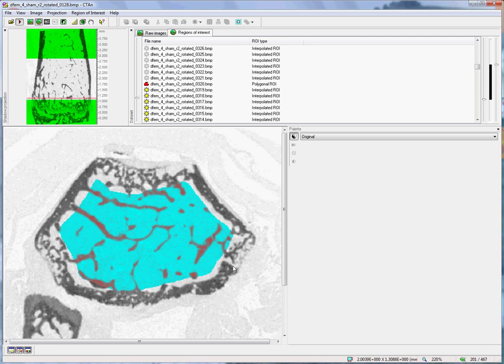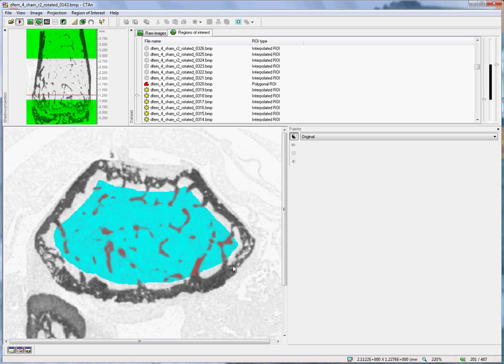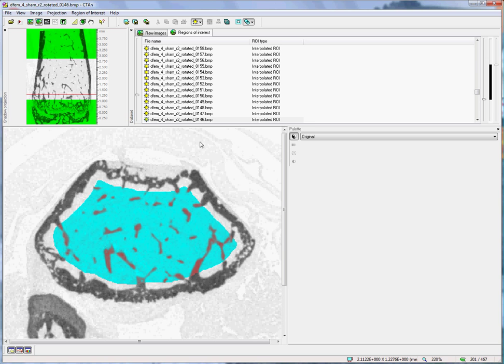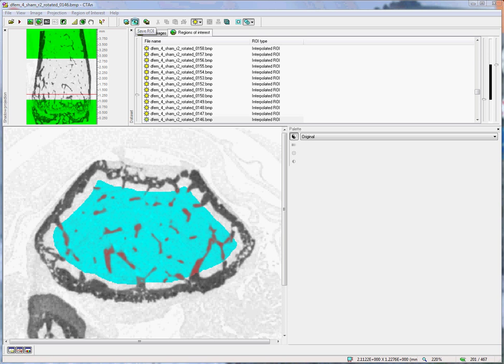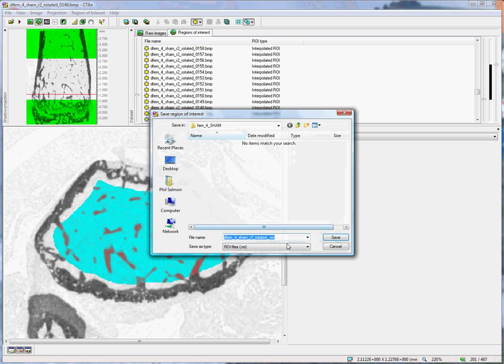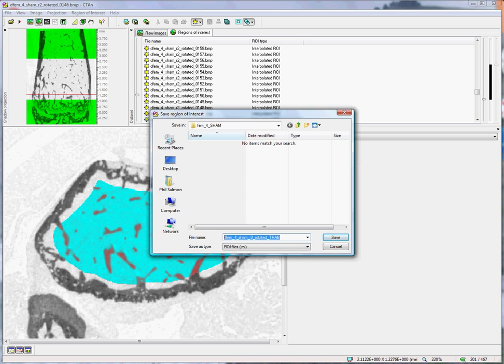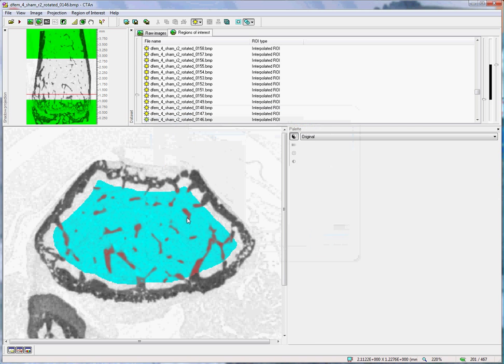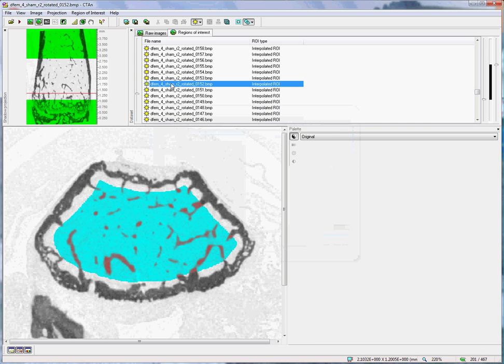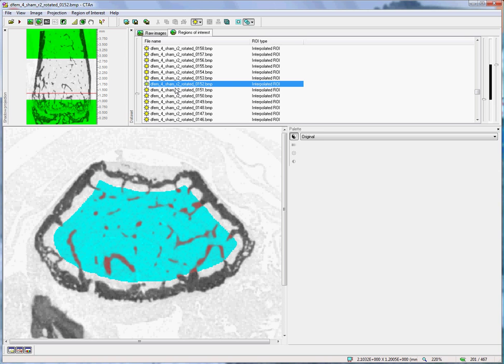If we're happy with the ROI, we click the second button at the ROI page Save ROI, and we give it a name such as T-R-A-B for trabecular.